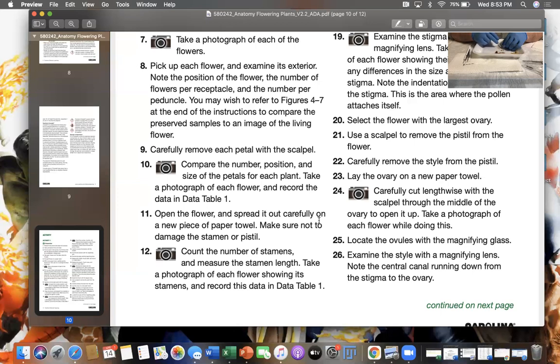And it's hard to tell if any of these long ones without a cap are simply damaged, or well, that's how they're supposed to be.